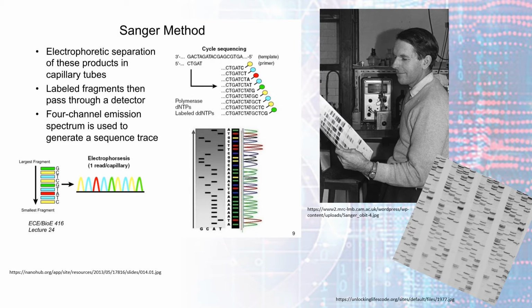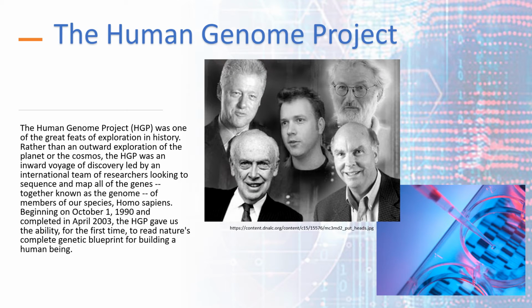Here's a quick glance at the Sanger method. As you can see, it has many steps, and because of that, everything is done by hand and extremely tedious. It wasn't until the Human Genome Project that the world of DNA sequencing got a little shook up.